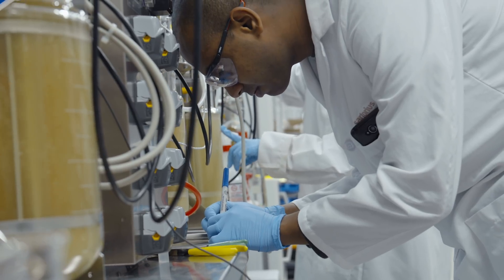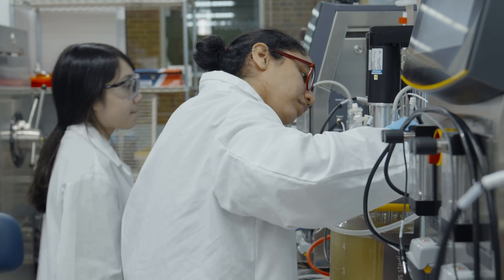A lot of labs that I've worked in in the past, stories that students will have is working with older equipment. They're rigging things up or trying to make things work as they're going through. But here everything is state-of-the-art and I'm really excited.